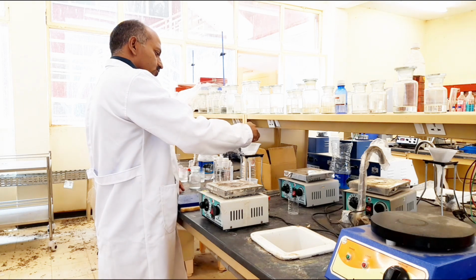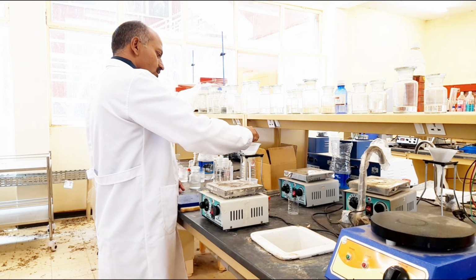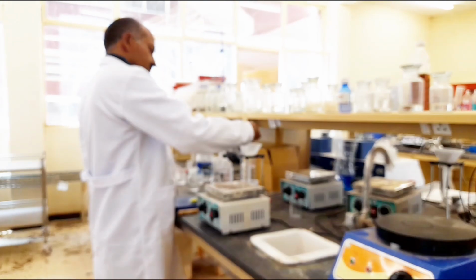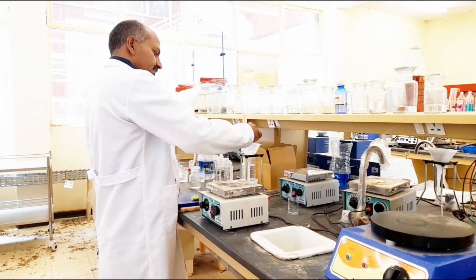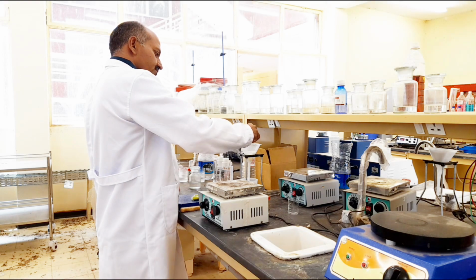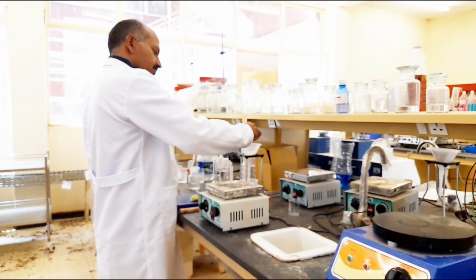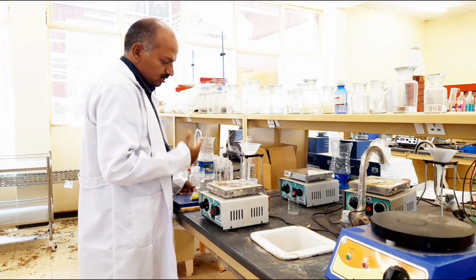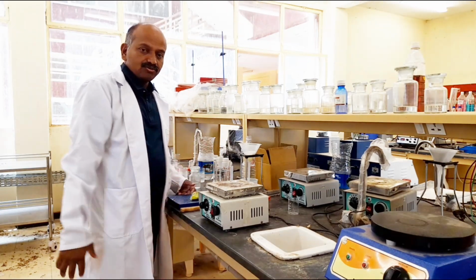The juice is completely squeezed out from the 2 halves. Filtration takes place. We have to collect the filtrate, which does not have any solid particles. Then we can perform the experimentation. We can determine the amount of citric acid from this lemon juice. The filtration process will take some time. Let us wait for some time to get the filtrate.